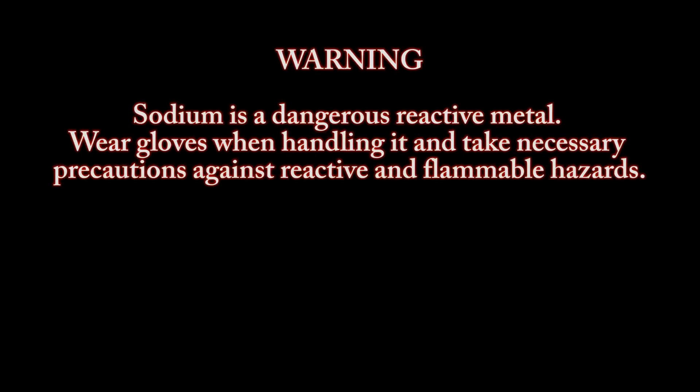Warning: sodium is a dangerous reactive metal. Wear gloves when handling it and take necessary precautions against reactive and flammable hazards.